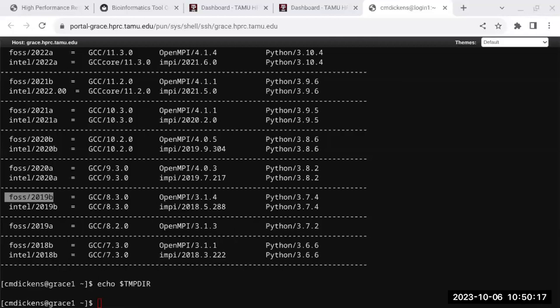This is just an example of how to use it. In this case, this is Picard tools. It has an option to specify a temp directory. Some software does not, but if it does, it can be useful because really the temp directory is a place for doing some processing. It writes files that you really don't need when the processing is done.